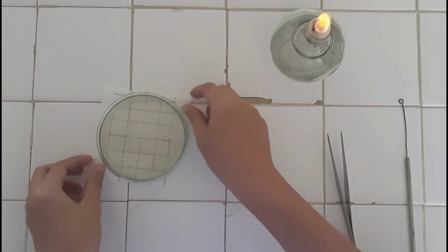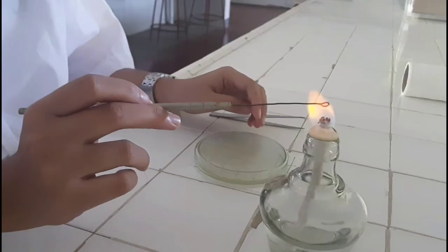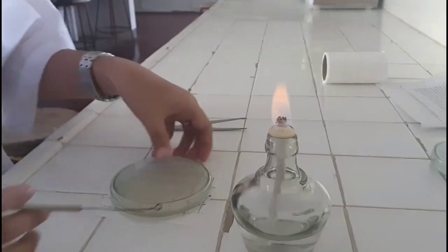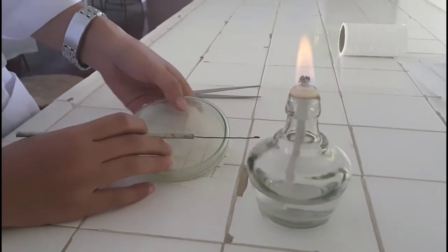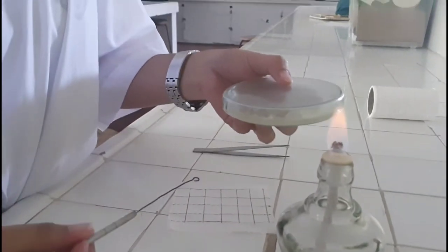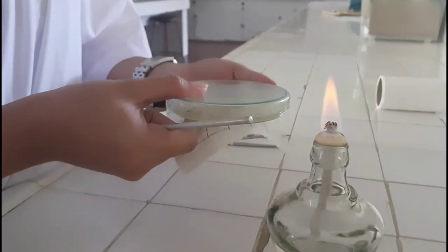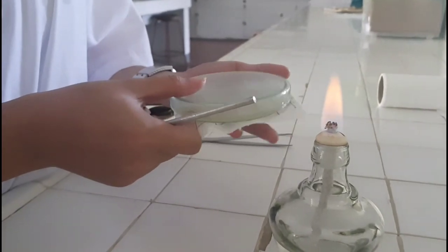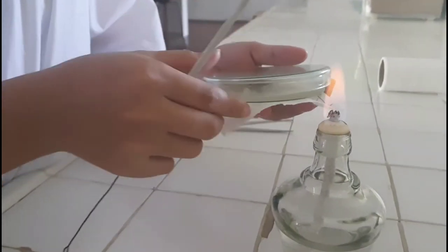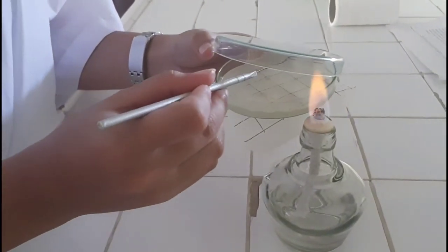To cut the solidified PDA, prepare a line as a guide to cut an exact centimeter of the agar block. Using the inoculating loop, aseptically cut the agar underneath with a line guide. Don't let the petri dish be far from the alcohol lamp so that there is no contamination that will enter inside.